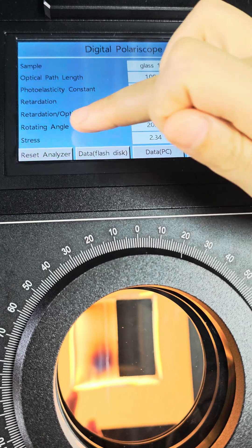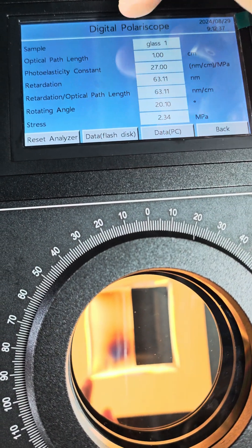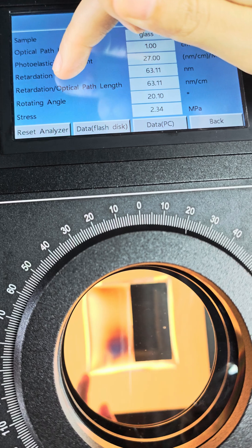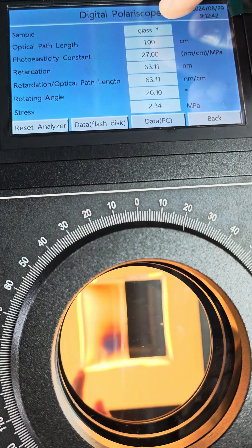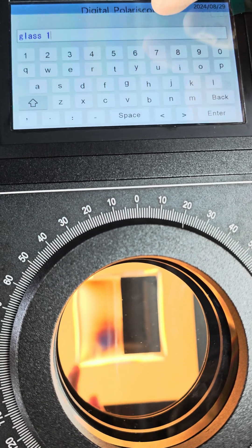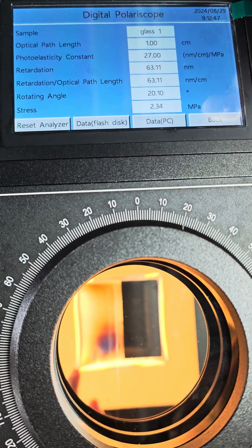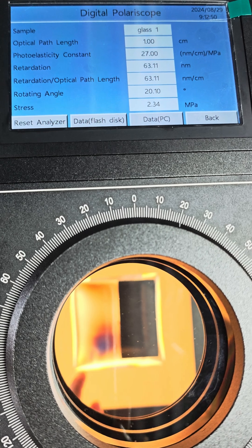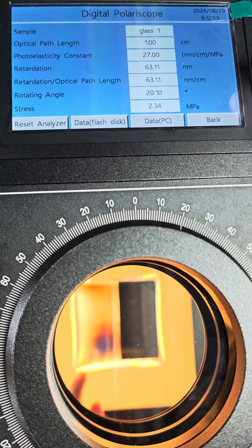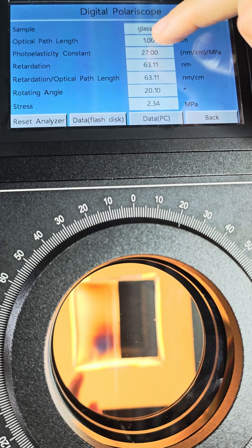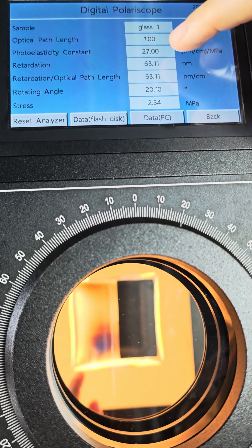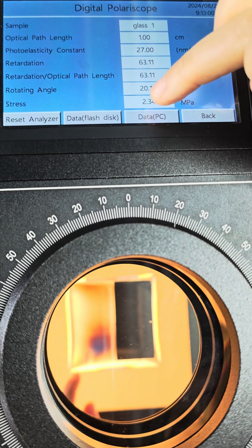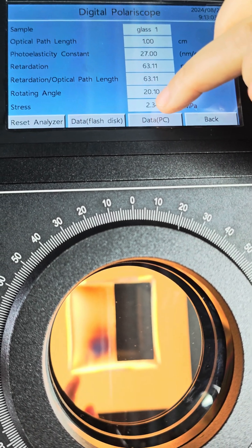We can see rotating angle here with a data value here. And we can also input a name for this sample. If we want to get accurate stress value, we need to input optical path length here and photoelastic constant here. Then we will get stress value here.